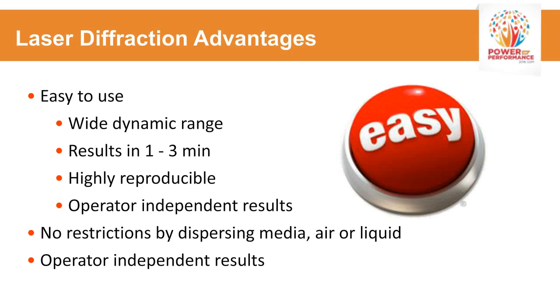The other advantage is these types of instruments are quite reproducible and also operator independent in the results. These kinds of instrumentation can be run in a dry state or a liquid suspension, such as alcohols or hexane or some other solvent that might be desired.